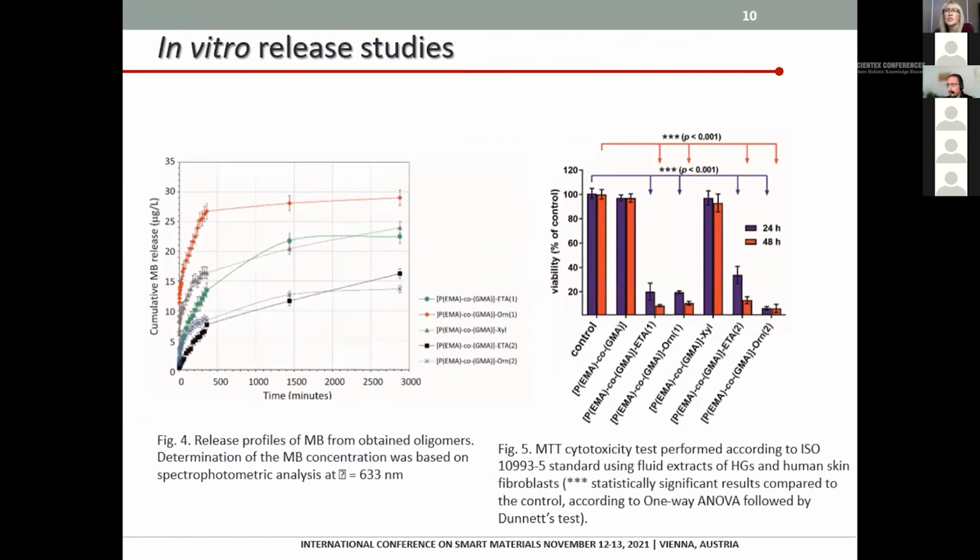For our applications, where the absorption of water, which means swelling behavior, is not the most crucial, each of the oligomers can be used for further research. Due to the fact that hydrogels used as a matrix for immobilizing active substances should have a compact structure of the polymer chain, where the polymer material must have adequate mechanical stability and stiffness, a small amount of 10% agarose was added for release of model compounds from the hydrogel matrix.